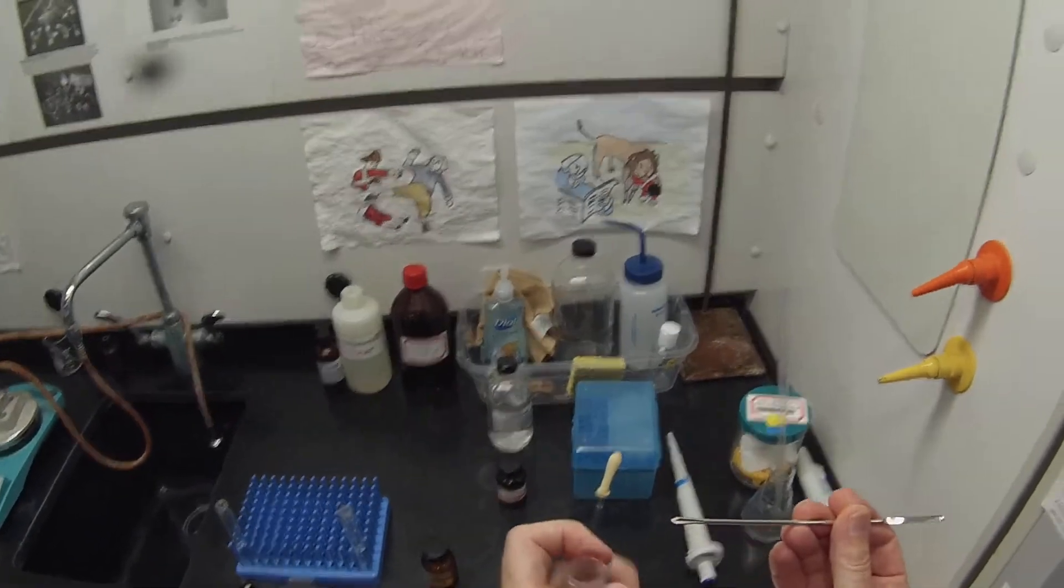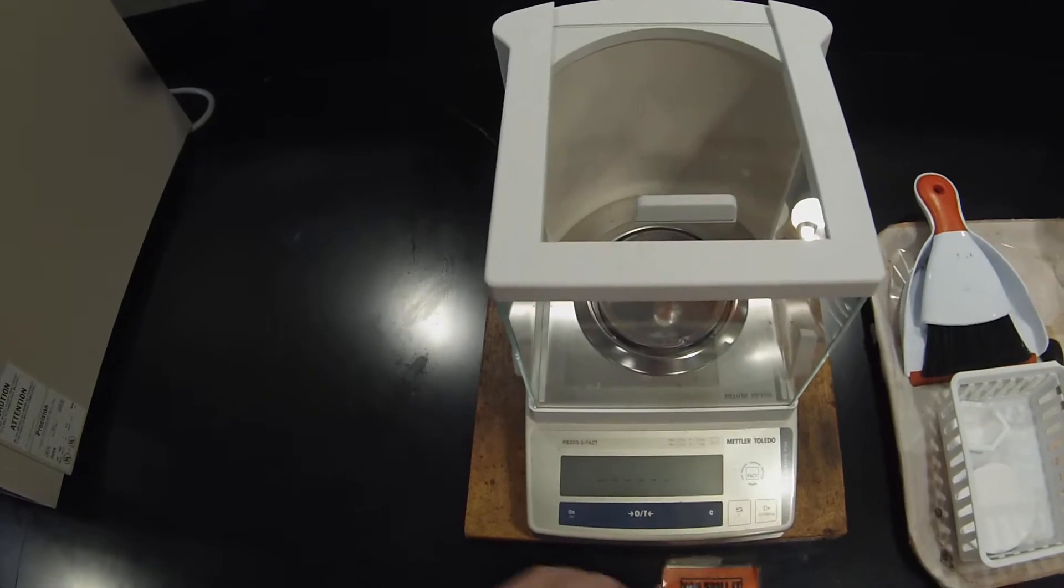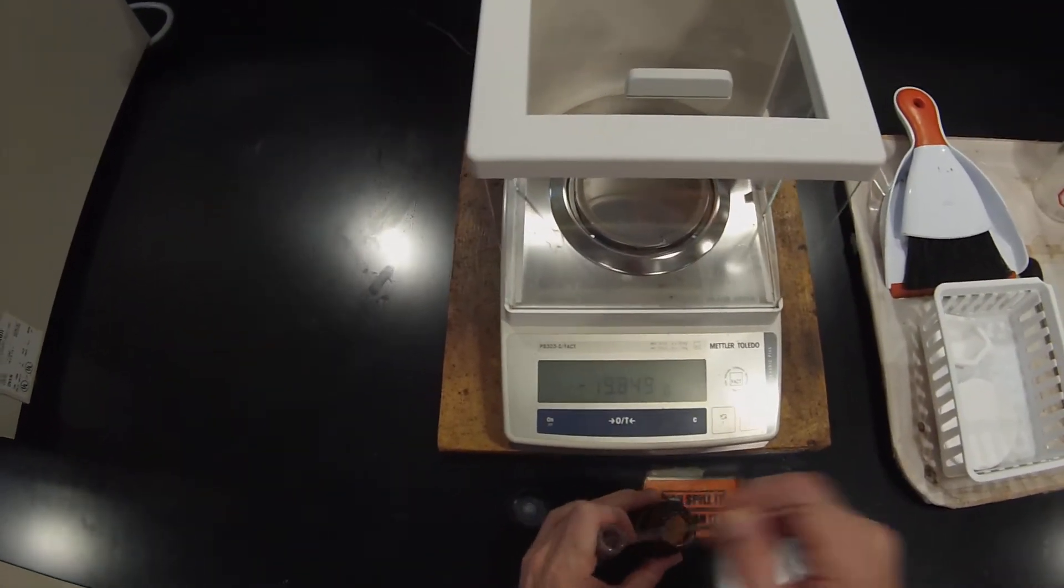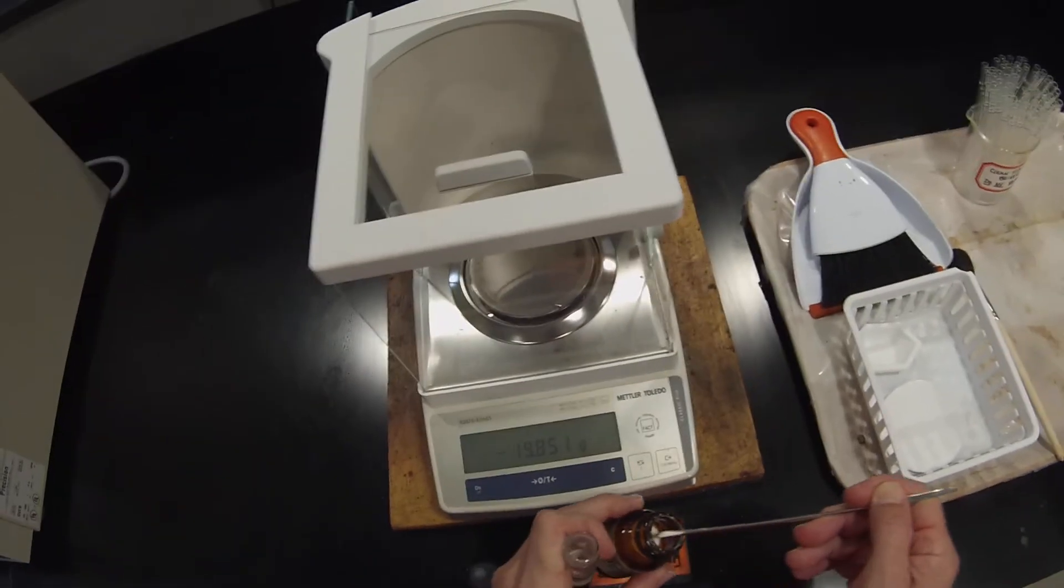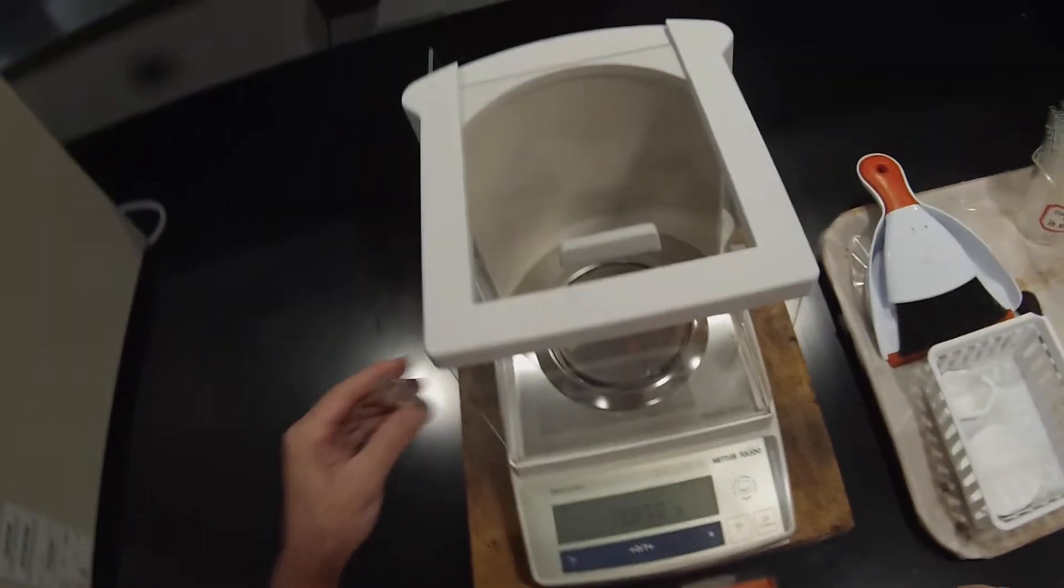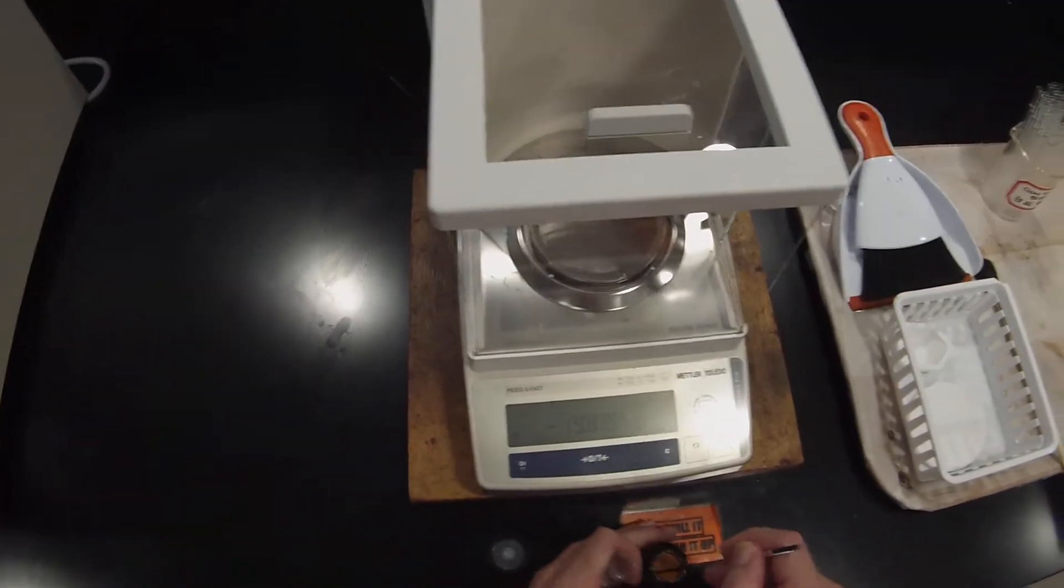So I need to measure out 0.2 grams. And the best thing for that is going to be this little V-shaped one of sodium carbonate. So we'll stick our vial in there and tare it. And one tick was about 0.01.